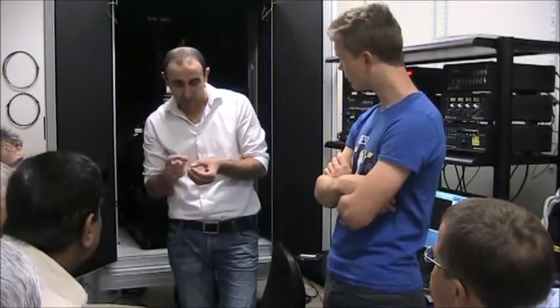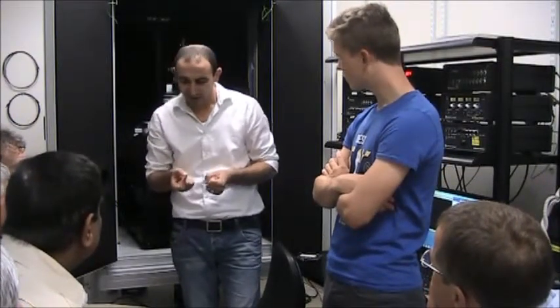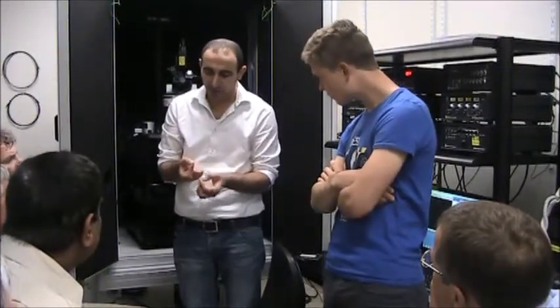We attach the tip or different types of probes, AFM probes, NSOM probes, thermal probes, and different other probes to the tuning fork rigidly, and that will be part of the tuning fork. And then this will be used, in fact there is no optics, just this small piece will be used for AFM feedback. It could be in amplitude feedback mode or in phase feedback mode.